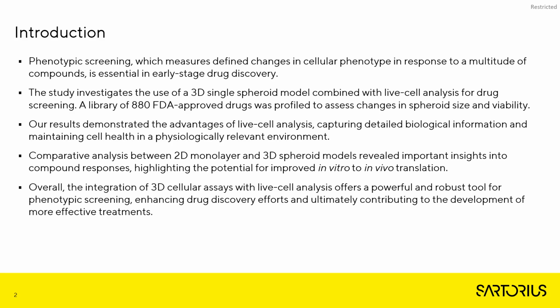Overall, the integration of 3D cellular assays with live cell analysis offers a powerful and robust tool for phenotypic screening, enhancing drug discovery efforts and ultimately contributing to the development of more effective treatments.